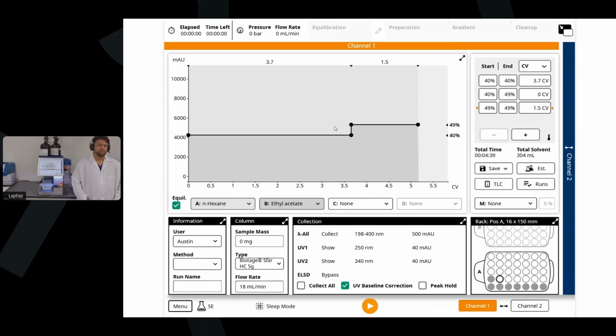Thanks for providing insight on how automation helps labs. Your next question from our viewer is, we have experienced chemists and new users sharing the same system. What are the best practices for ensuring consistent results across different operators?